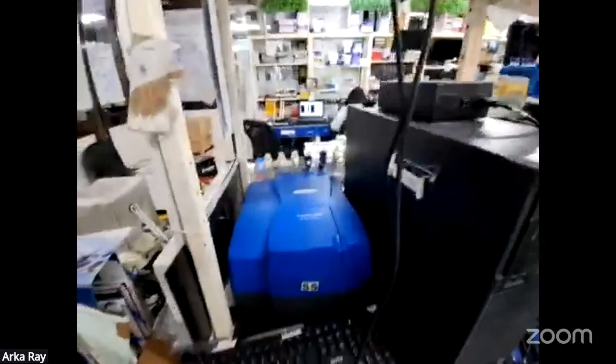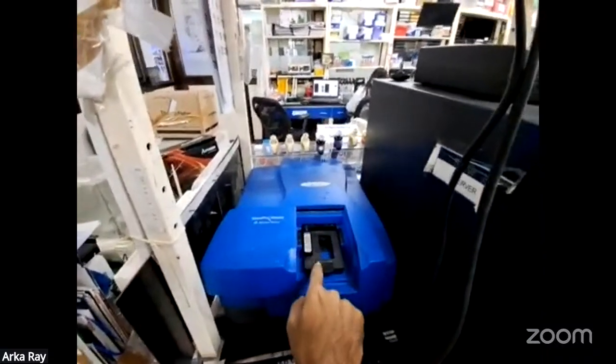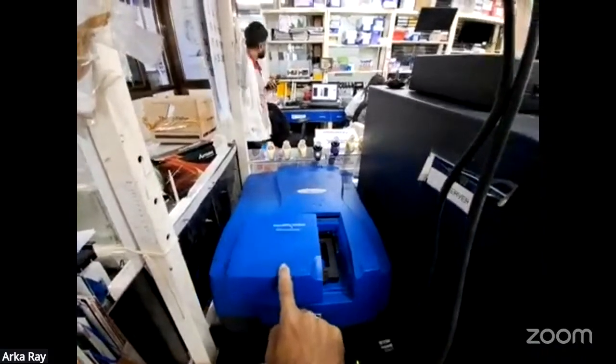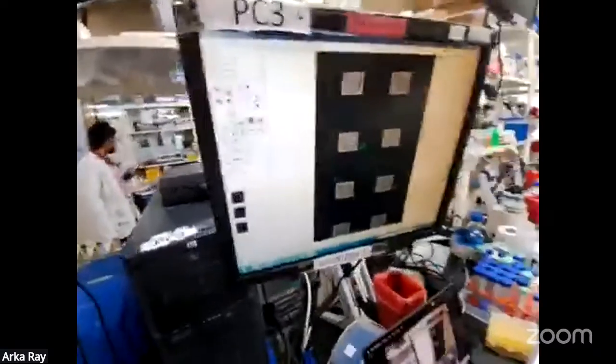Thank you so much. All of you have just heard about our data analysis, the experiments, and the protocol. Now let me show you the scanner and how we access or extract the data. So this is our scanner. In this place you need to insert the chip, and we are having some time issues, so we are not scanning the slide now. I'll directly show you the images.